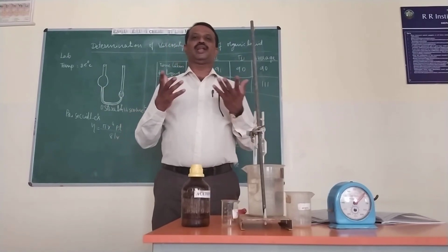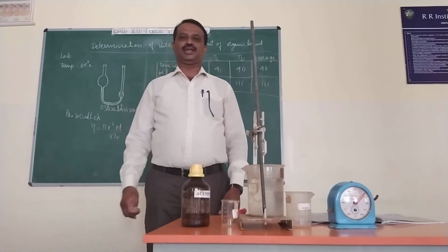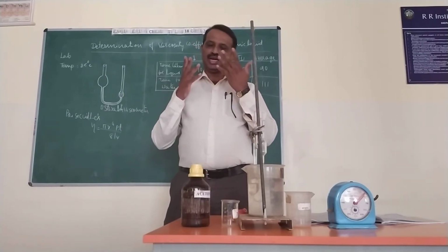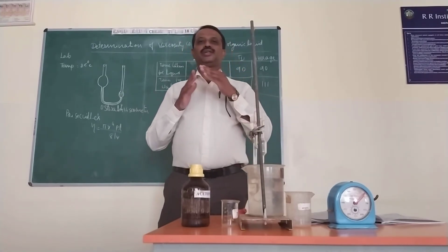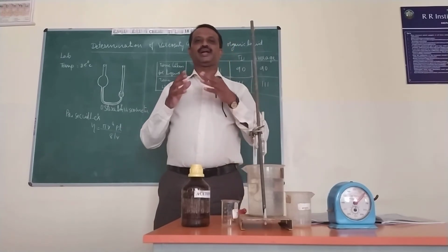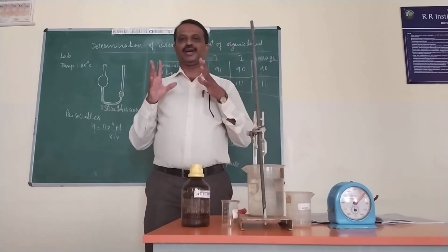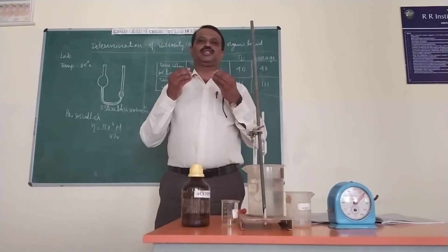So generally, what is the meaning of viscosity? It is the friction between two layers of liquids. It is especially between two layers of solids also, and there is more, but in liquids it is very small compared to solids. To compare this, we take the examples of 3 liquids. One is pure water, another is castor oil, and another is petrol.